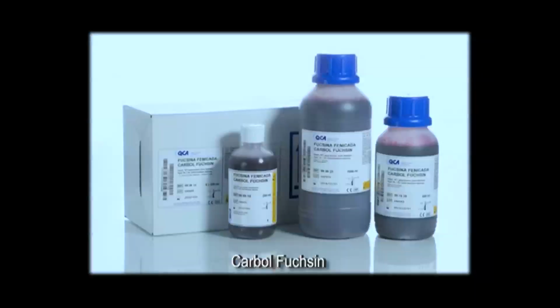Now, in acid-fast staining, generally we use carbol fuchsin. Carbol fuchsin is made soluble in 5% phenol. The reason behind this is that carbol fuchsin is insoluble in water or alcohol. Now, generally the cell walls of Mycobacterium contain a lipid which is known as mycolic acids. The presence of mycolic acids in these Mycobacterium makes the staining through other processes very difficult. As a result, acid-fast staining is exclusively used to identify them.